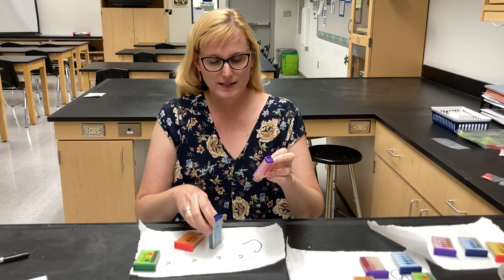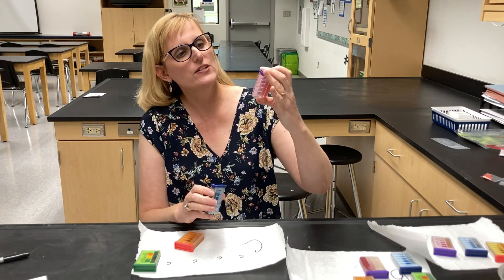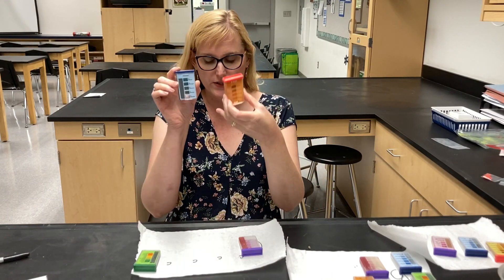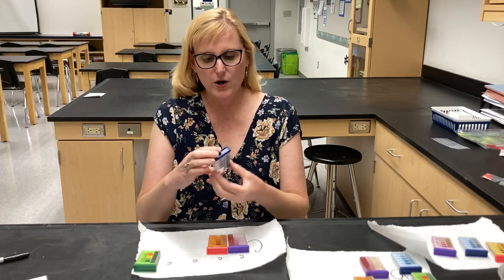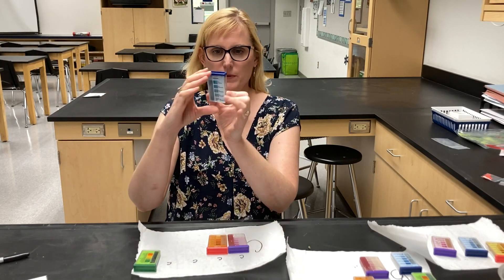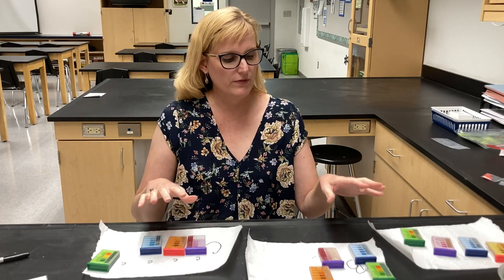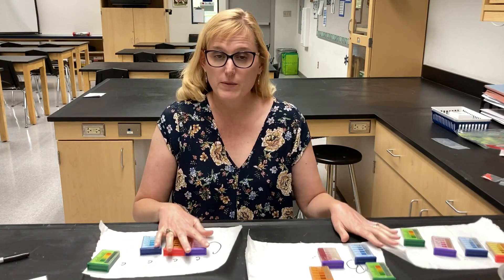So for soil sample C, the nitrogen is more like sufficient but it's kind of on the border between adequate and sufficient, and the phosphorus and potassium are adequate as well — kind of in the middle of the road. If we have our five levels: depleted, deficient, adequate, sufficient, and surplus — adequate is right in the middle. Those are our results, and I will have pictures of all of these side by side to compare which sample had the highest level of each of the four tests.